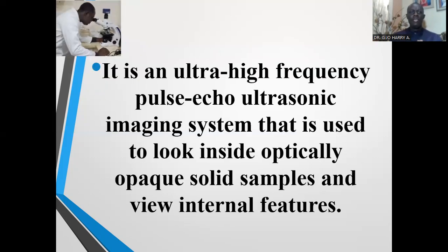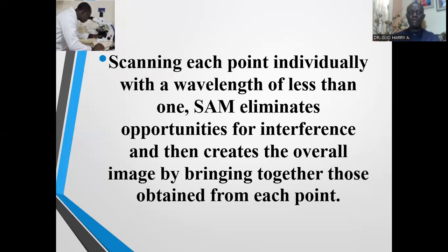It is an ultra-high frequency pulse echo ultrasonic imaging system that is used to look inside optically opaque solid samples and view internal structures. So it is very useful in viewing the internal structures of optically opaque solid samples.